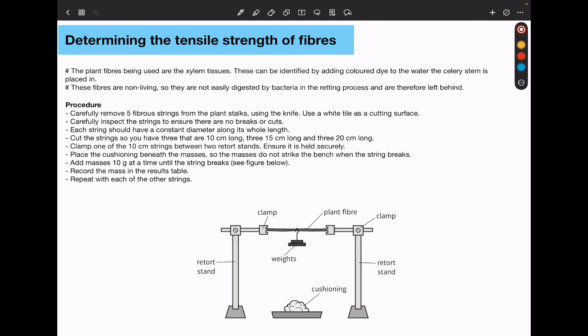The key thing is the fiber that is going to have the greatest strength is going to be the one that takes longer to be broken or the one that requires more masses to be broken. The one that is the weakest is going to be the one that breaks fast.